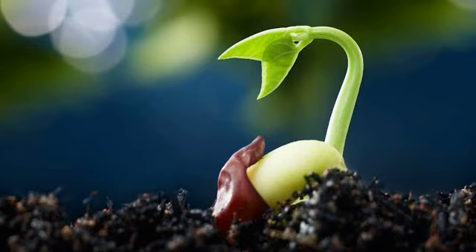Procedure: from the working sample, take 400 seeds at random. Method can be between paper BP or top of paper TP as per recommendations for crops. Planting seeds: 100 seeds multiplied by 4 replications, 50 multiplied by 8 replications, or 25 multiplied by 16 replications. Provide temperature, light, and humidity as recommended. Germination count, first and final, as per the species.